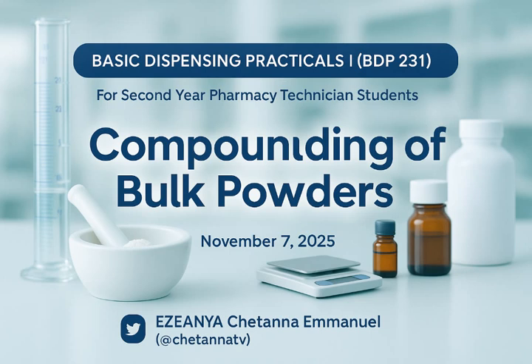You get the powder A. Let's assume the powder A is the one that has the smaller quantity. Get that one first. If you get that one, you put it in your mortar. Let's assume this one is 5 grams, and this one is normally 100 grams. You get that smallest or smaller one, depending on the quantity or number of powders in question.